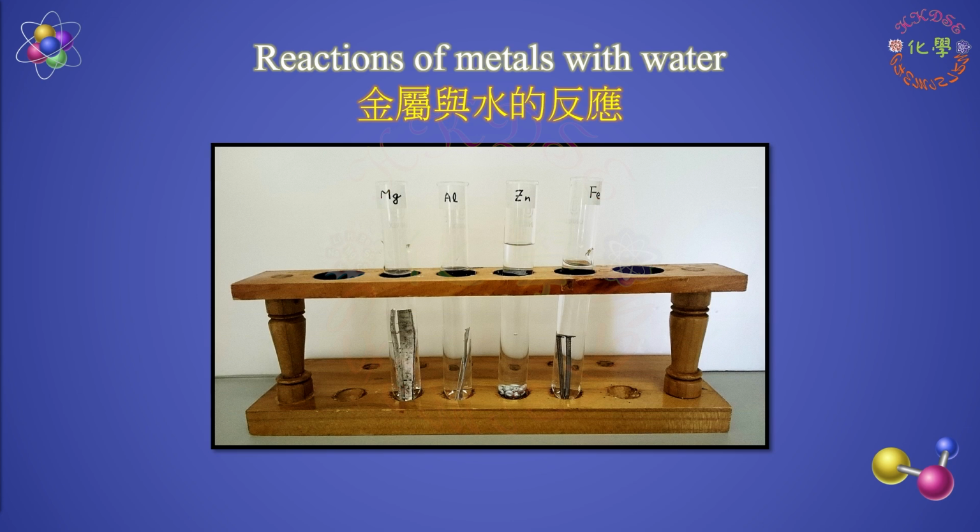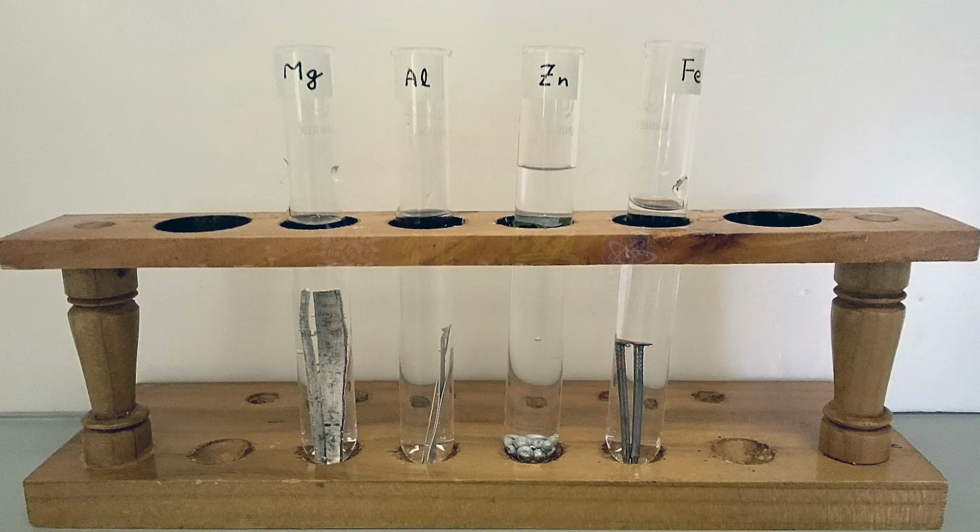Only the surface of the magnesium is giving off bubbles. Compare the reaction of sodium metal with water. The reaction of magnesium is slower, and for the reaction of other metals with water, their reaction is extremely slow.